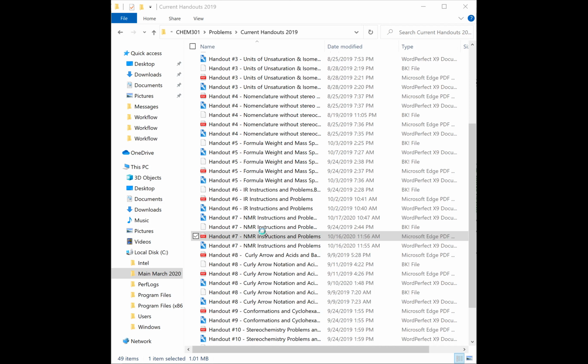Well, what about disubstituted, but they're not the same? So notice this time the A is different than the Z. So this one and this one are no longer identical. So you're going to get 1, 2, 3, 4 peaks. Here, you're going to get 1, 2, 3, 4 peaks. And here you will get 2 peaks because this side of the molecule is not the same as that side of the molecule.